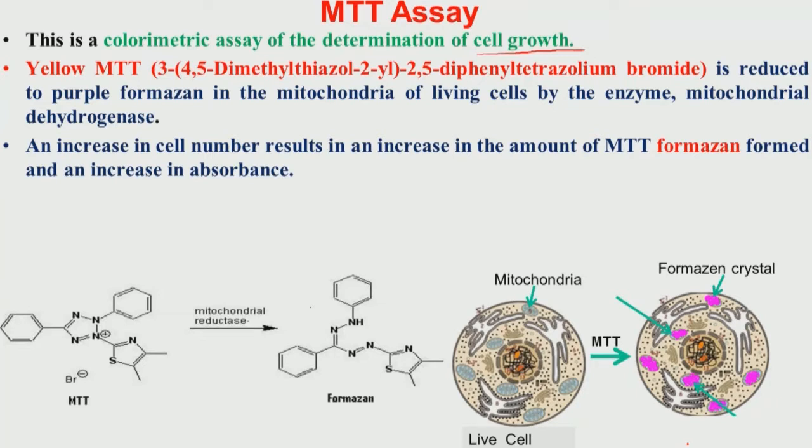So, I repeat, whenever you use certain biochemical assays, it interacts with some of the organelles within the cell or some biological macromolecules or proteins in the cell structure, and after it interacts, it will change the color.